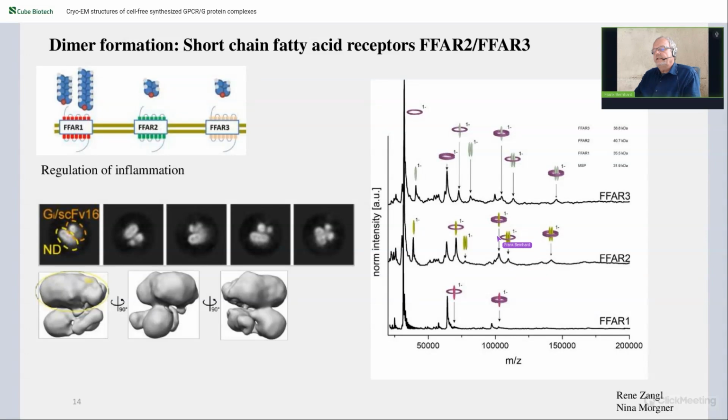And to show that we really have a dimerization, we implemented native mass spectrometry, where the complexes are dissociated by increasing laser beams. And you can see here nice signals of the dimer in the nanodisc or attached with a scaffold protein dimer, or with a scaffold protein monomer.